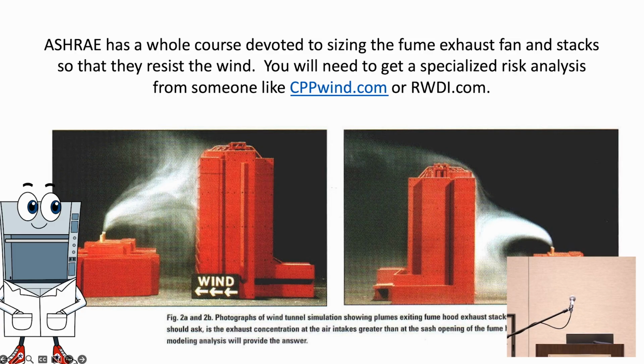I haven't had good luck with chemists wanting to protect themselves. They don't help me help them be safe. But in this case, it's not just the chemist, it's everyone in the building. Janitorial, visitors, students, staff, administrative, they're all getting chemicals they did not sign up for. The chemists at least sort of acknowledge they work with chemicals and they might get exposed. All those other people are not on board with this. So with all these little fans, something needs to be done, because whenever the wind blows, it's going into the building.